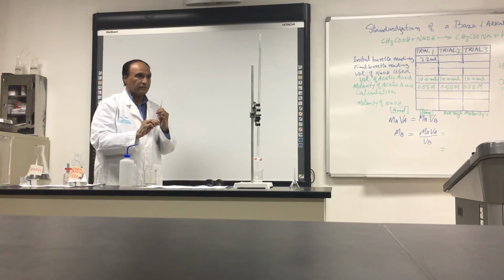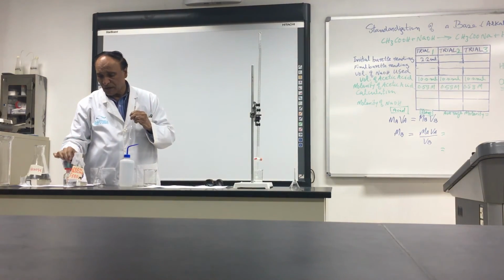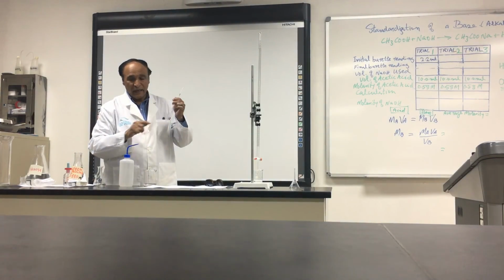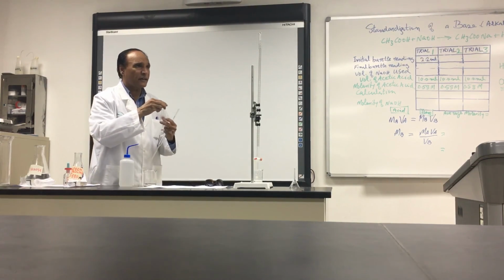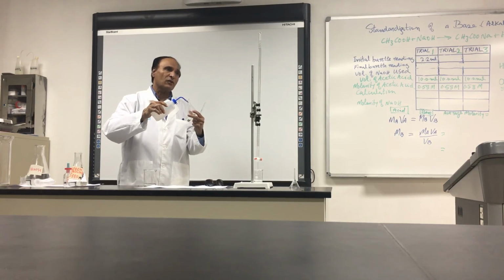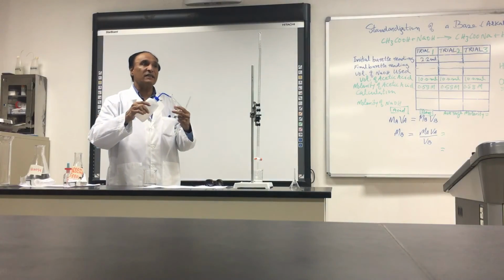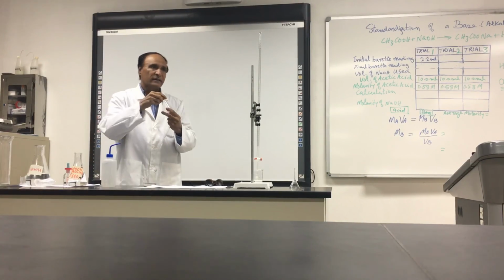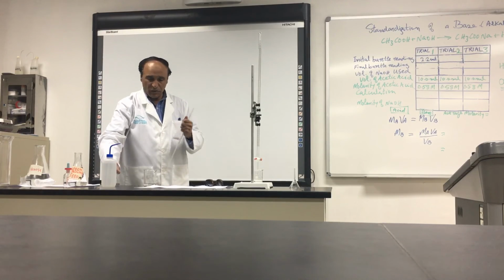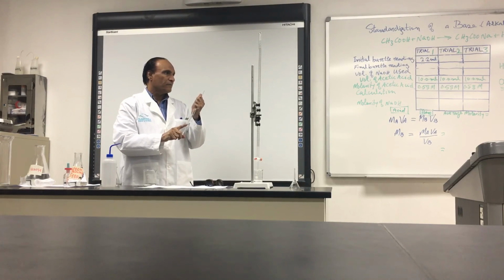I showed you. Now we want to wash it with acetic acid because there are some drops. If there is some water here, look over here, it makes no difference. I put some water just to show you that. Look over here, there is some water and it makes no difference. But there should not be any water here.